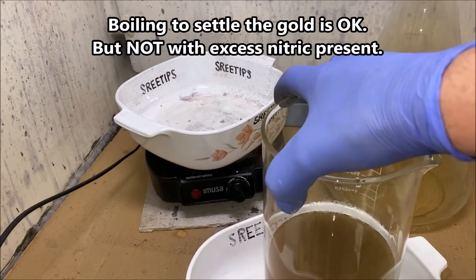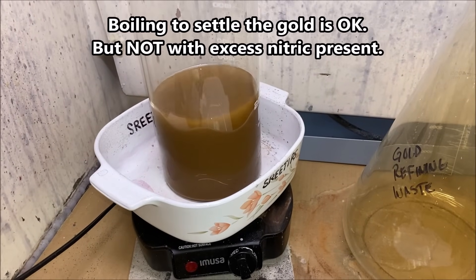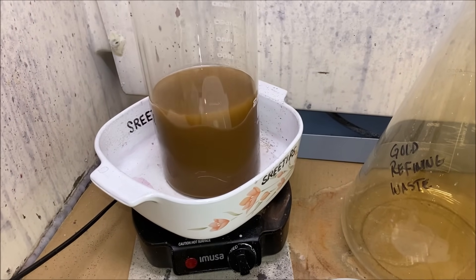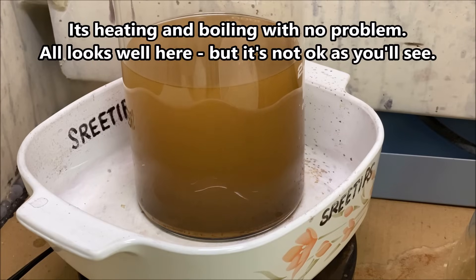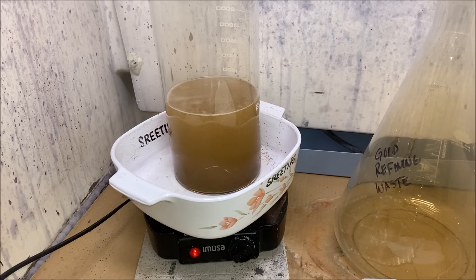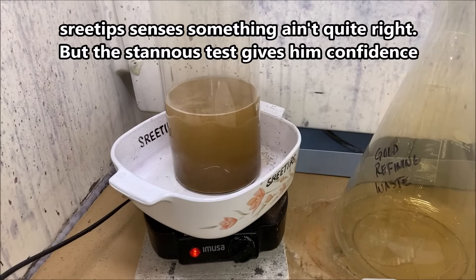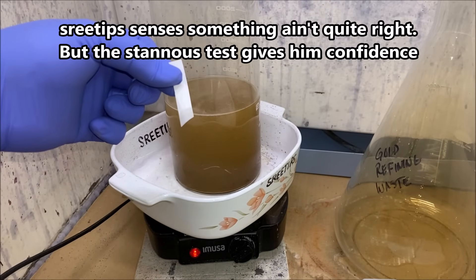Alright, we're going to put this up on the heat to see if we can get it to settle out. It's been boiling now for about 20 minutes. I'll get a little of the solution on a piece of filter and do a Stannous test.